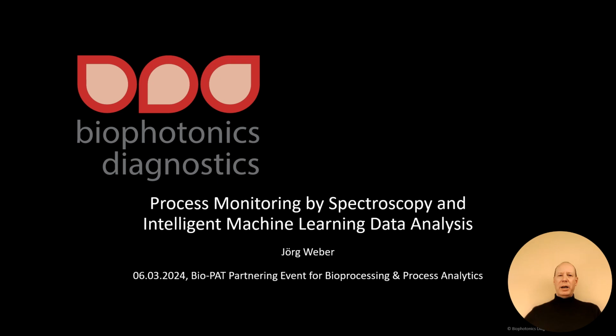But today I would like to give you an insight into the things we do, especially in the spectroscopic part of process analytical technology, with the focus on machine learning data analysis. This is the main focus we work on.